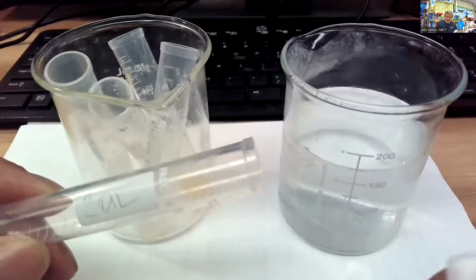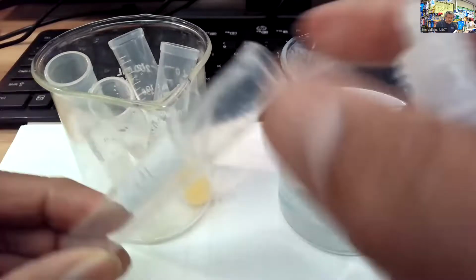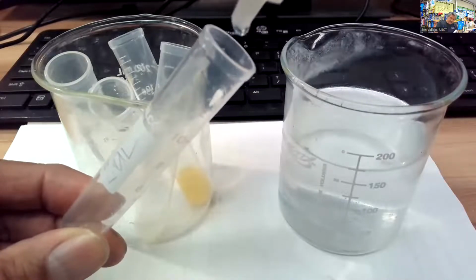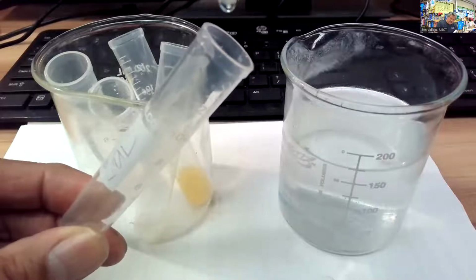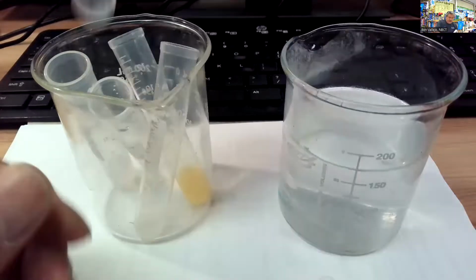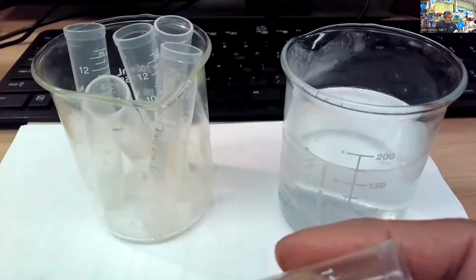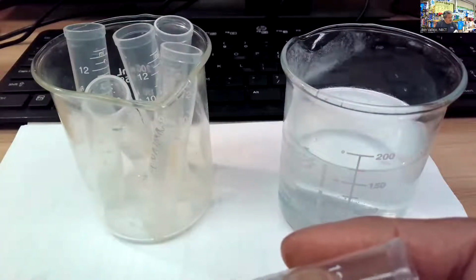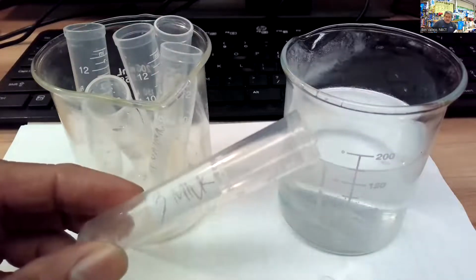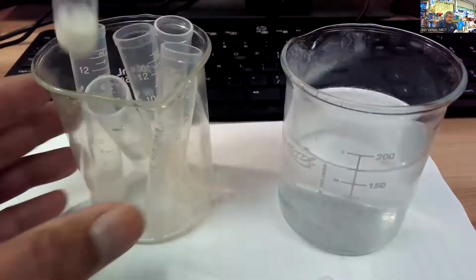Oil is, since this is qualitative, it doesn't matter that I'm not adding exactly the same amount. It gets a little icky with the oil, so I'm just going to put 5 drops in here. 1, 2, 3, 4, 5. That'll still give us enough to give us an indication whether we have the monosaccharide from the Benedict solution test. And here's the milk. So I'm going to take a squirt full of milk, put it in there. So here are my 6 test tubes right here.